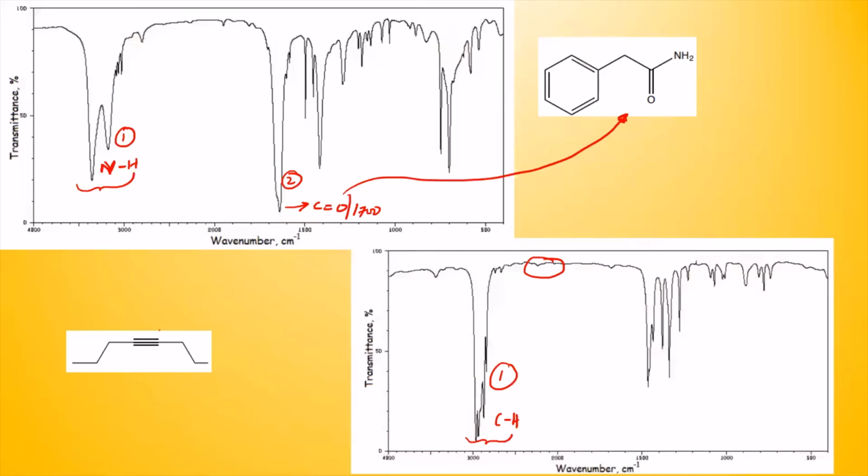Again, you got to use the table. You cannot memorize all of this, right? So I know this is this and this is this. This is probably my least favorite molecule example I've given, but I've shown that just to show you how occasionally it may not be clear cut, but when you compare two things, it's going to be easier, right? Again, I don't remember the table. I used the table to figure this out, right? So you'd have to use the table to figure it out.